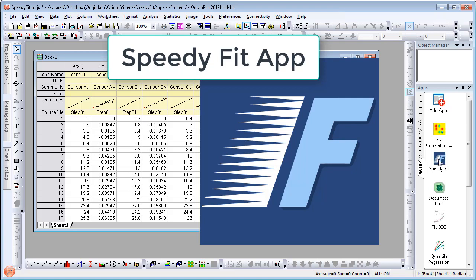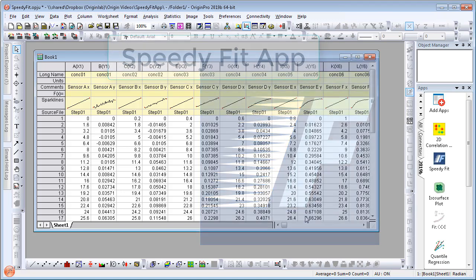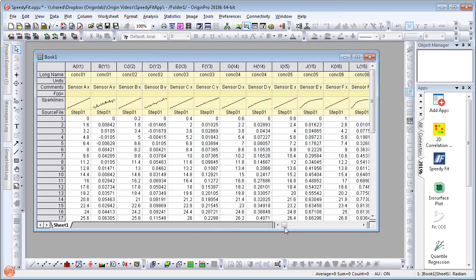The Speedy Fit app, introduced in version 2019b, lets you perform quick fitting to multiple data sets. You can start from either a worksheet or a graph.